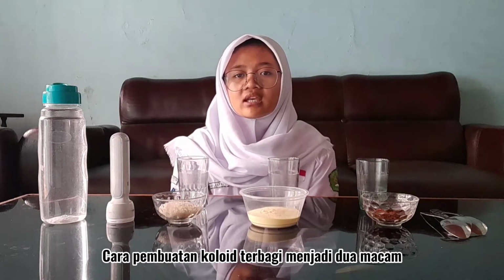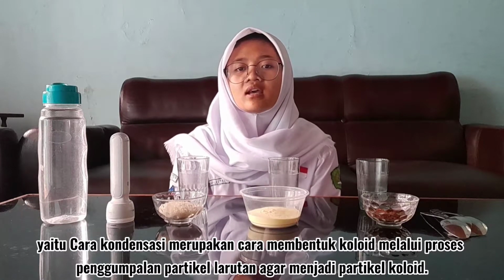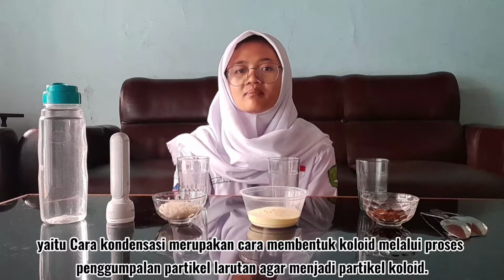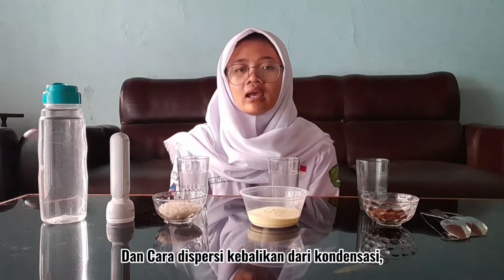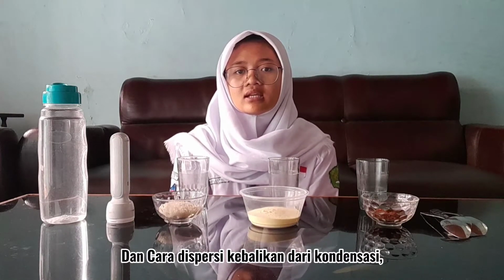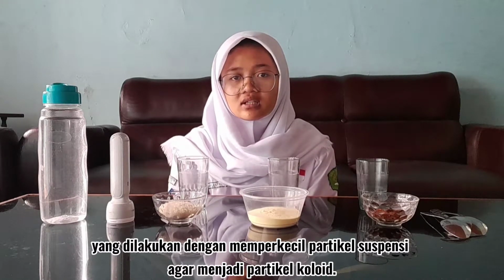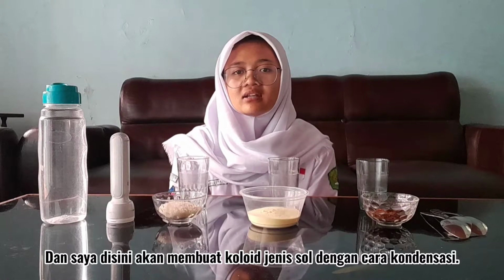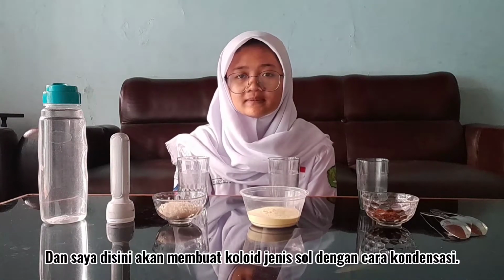The methods of making colloids can be divided into two types, namely the condensation method, which is the method of forming colloids through the process of clumping solution particles into colloid particles, and the dispersion method, which is the opposite of condensation, namely by reducing suspension particles to colloidal particles. And here I will make a sol-type colloid by means of condensation.